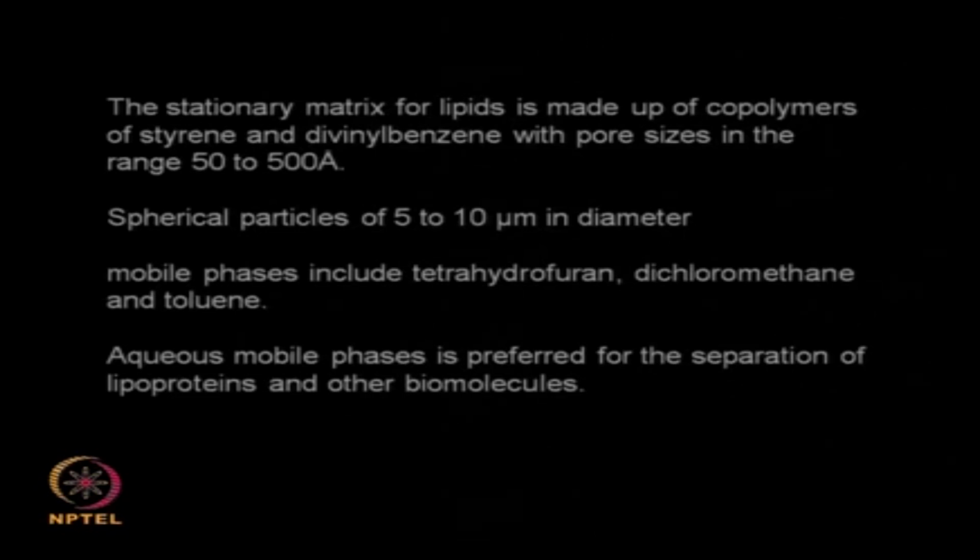So this gel permeation chromatography can be used for proteins, biomolecules, it can be used for small molecules, it can be used for synthetic polymers, natural polymers and so on. As I said, it can be used for both purification as well as for analysis.